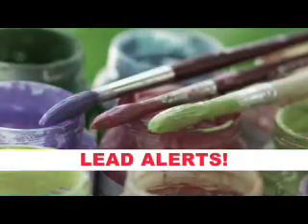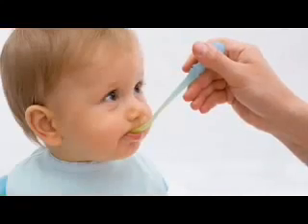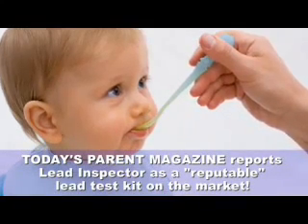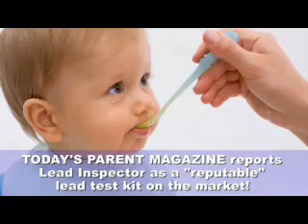Lead is practically everywhere in today's environment, but lead is also especially poisonous to human beings. Even tiny amounts of it in our blood, measured in millionths of grams, can be harmful to our health. Since you can't see, taste, or smell lead, testing is necessary.